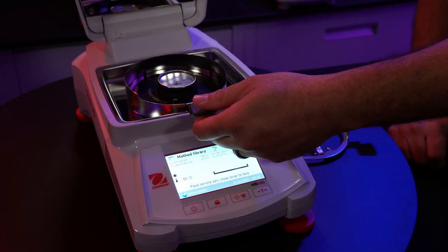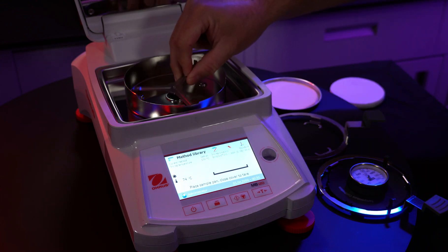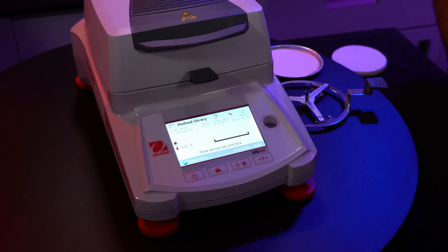Remove the temperature calibration tool. Be careful, it is hot. Place the pan support back onto the balance. Place the sample pan holder back into the unit. Hit exit and now we're ready to begin testing on samples.